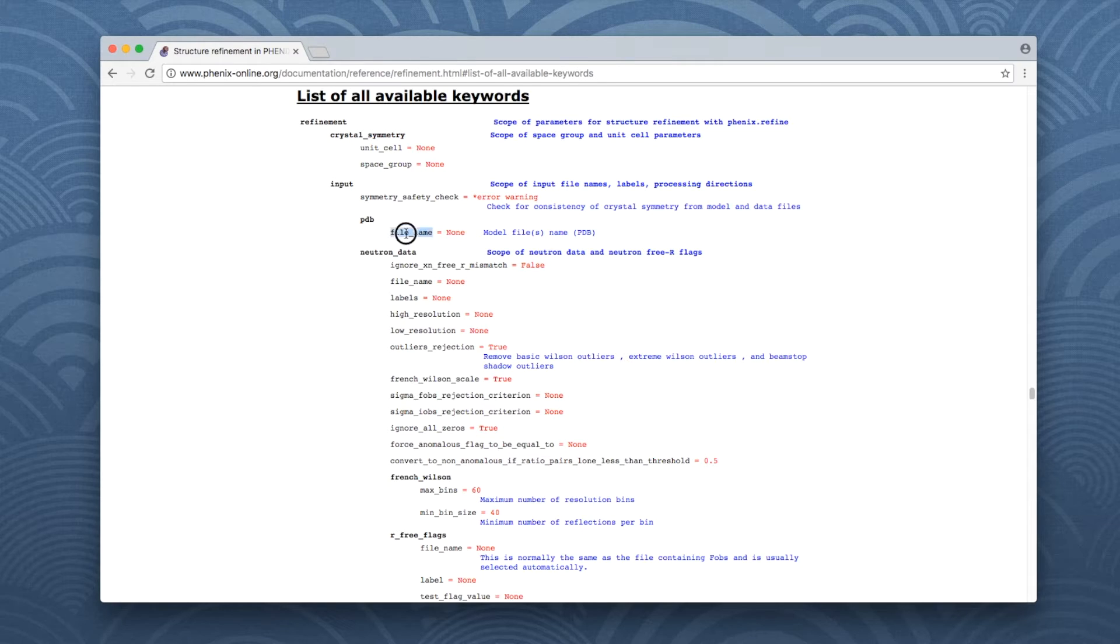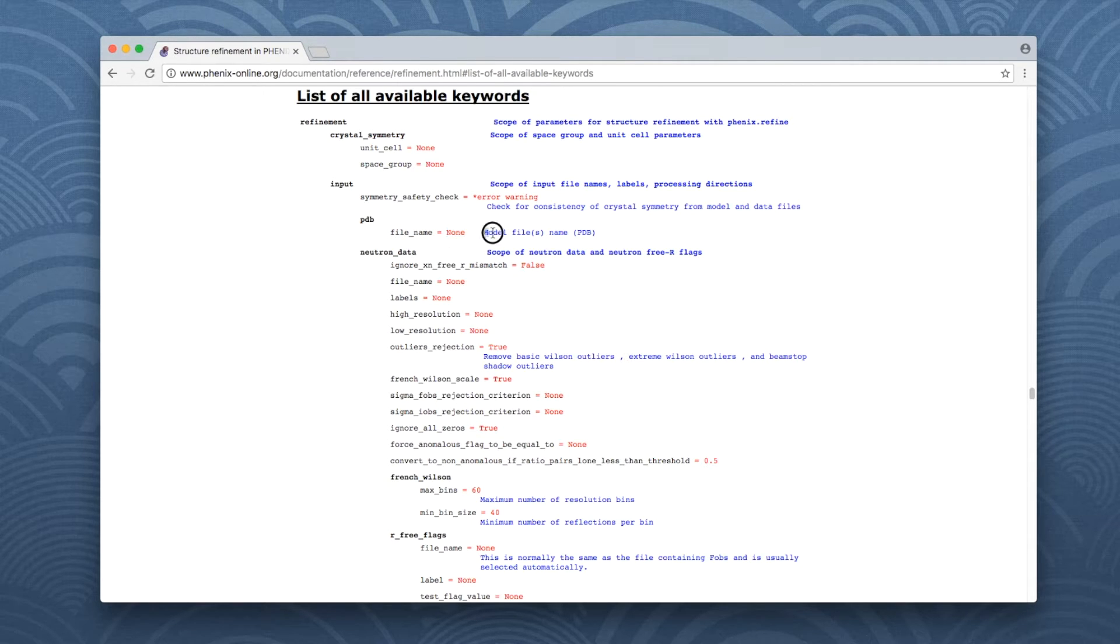The parameter is written in black, the default value in red, and the description of the parameter is in blue.